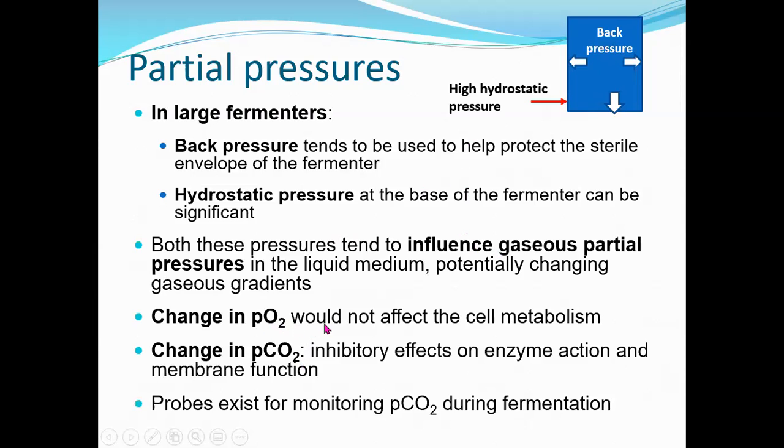Usually the change in partial pressure of oxygen won't change the cell metabolism so much, but the change in partial pressure of carbon dioxide will have an inhibitory effect on the enzyme action, the membrane function, and the basic metabolism of the cells. Therefore, the partial pressure of CO2 needs to be monitored, which is done by various sensors or probes during fermentation.